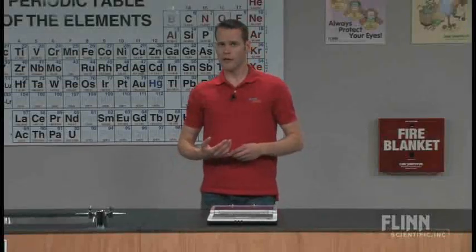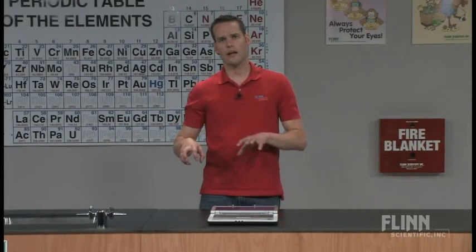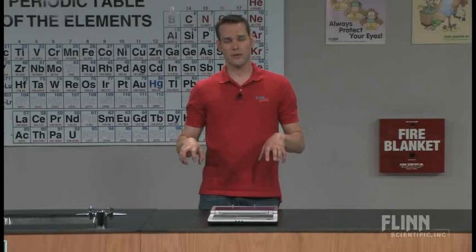And now I want to show you a third way that we can demonstrate the way that this reaction is functioning. I have set up on my laptop here a computerized probe that collects the concentration of dissolved oxygen inside of a solution, and a video that's been attached. So the video is embedded with the data collection software, and then will play simultaneously with the data collection when you replay it.